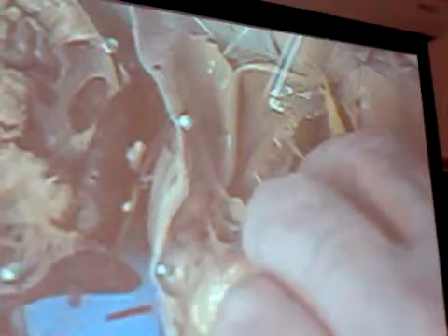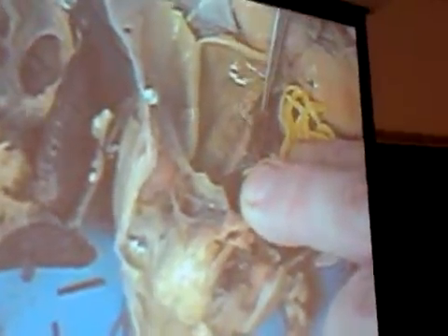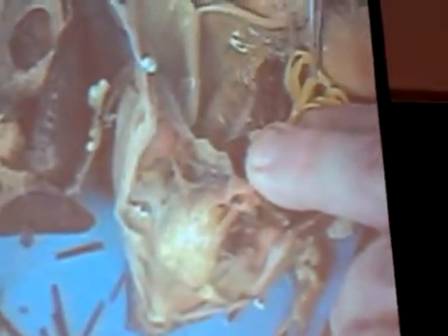Let's get under here. Let's see. The other lung. You see it. There is the lung. Here is the kidney, right? Follow it right there. Do you see that dark structure right there? That's the kidney. Makes perfectly good sense. That's the kidney. What was this stuff right here?